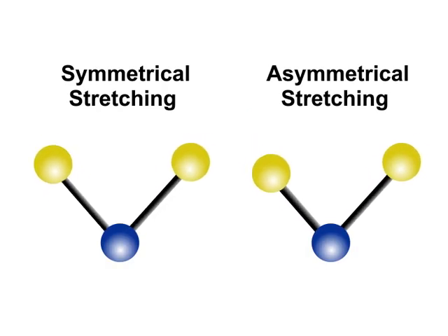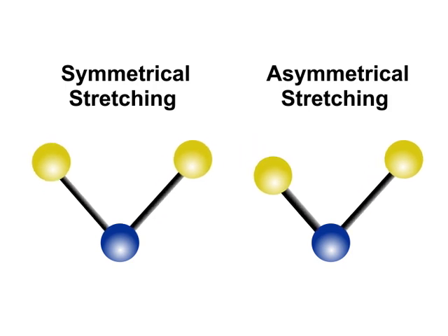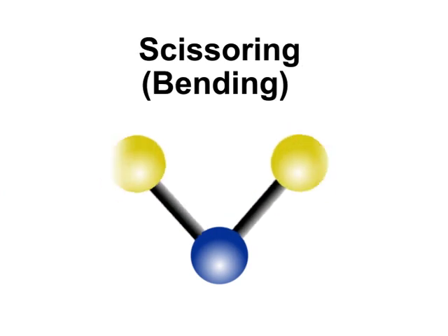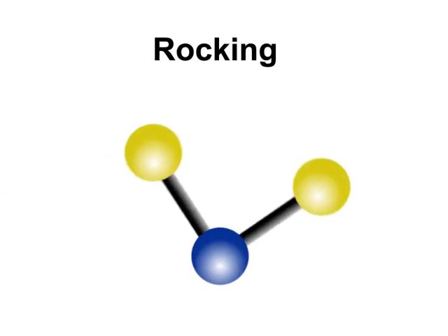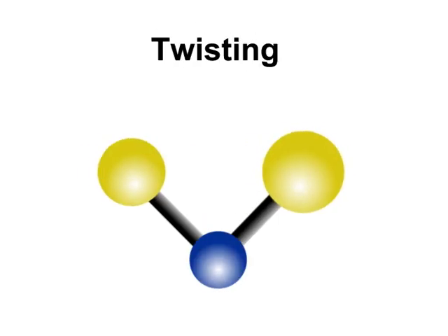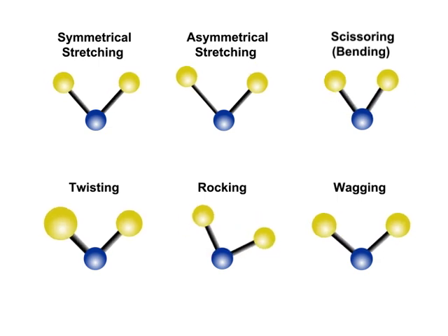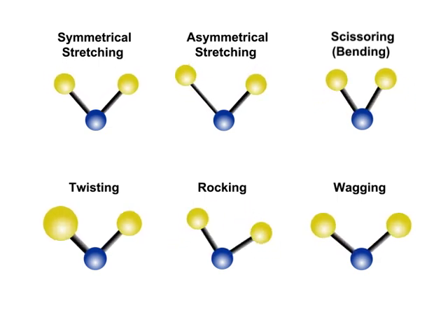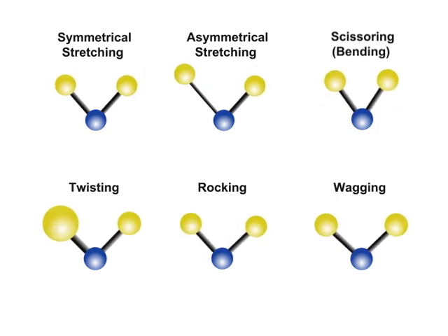Molecular vibrations and rotations arising from these interactions with incident photons include symmetrical and asymmetrical stretching, scissoring, rocking, wagging, and twisting. These molecular vibrations are used not only in Raman spectroscopy, but also alongside it with other techniques, like infrared spectroscopy.